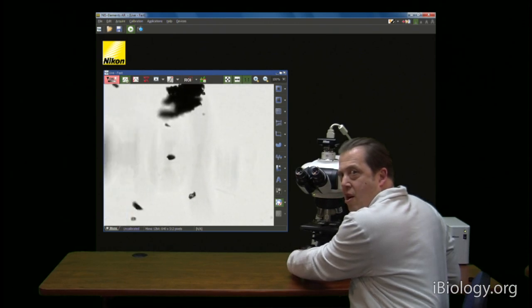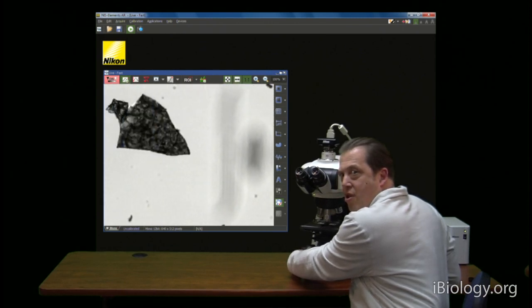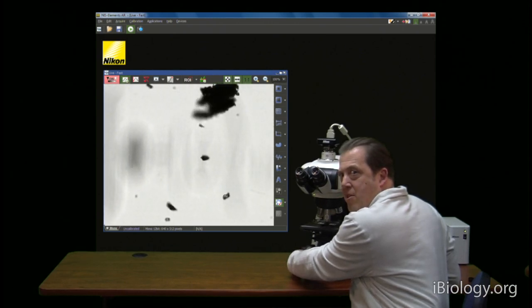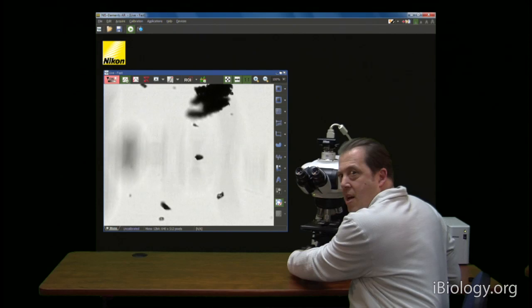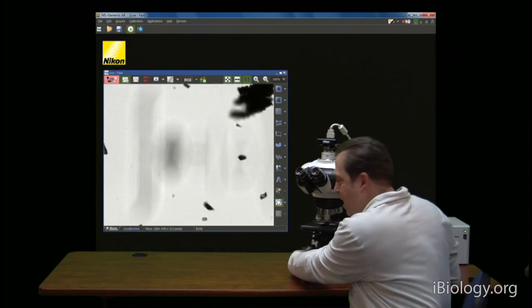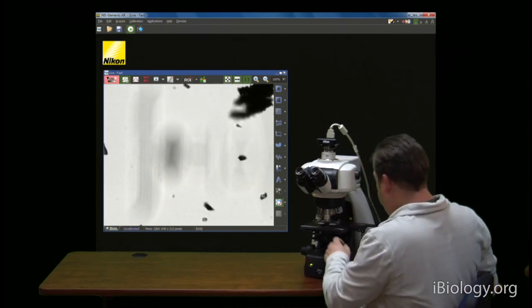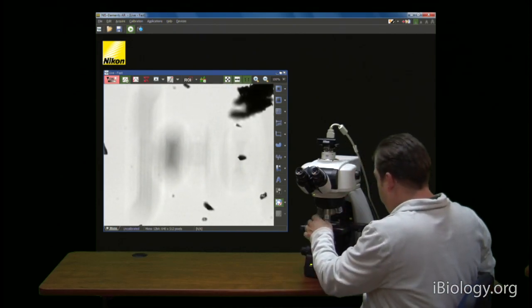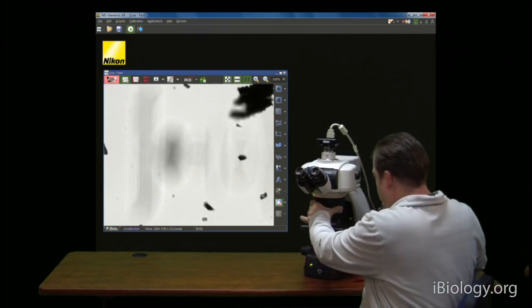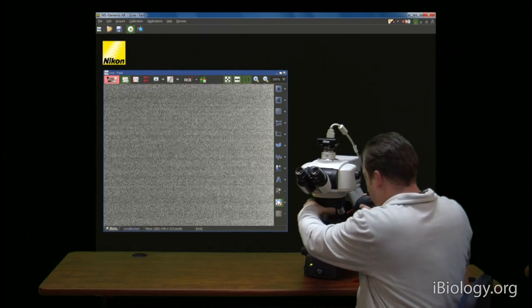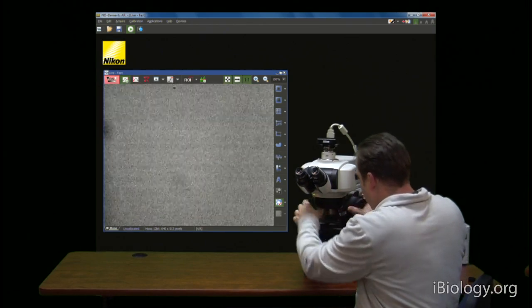And sure enough, there's all the dirt that's on our specimen. So let's now take our blower and blow out the dirt that's on that.